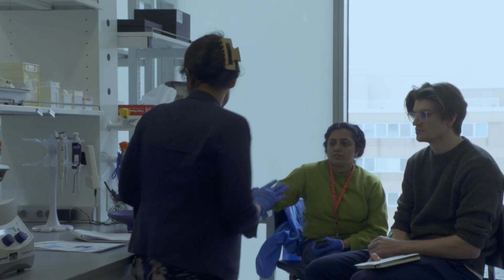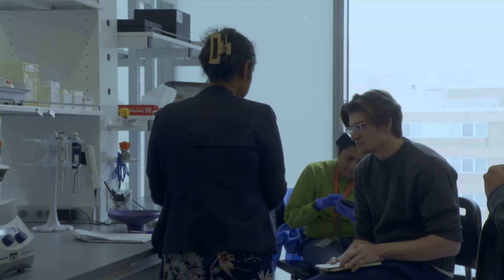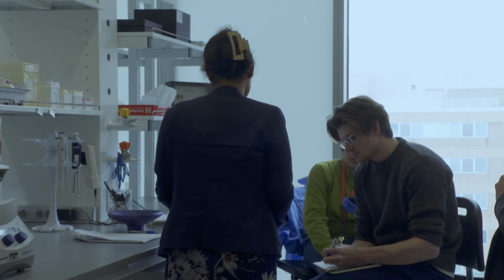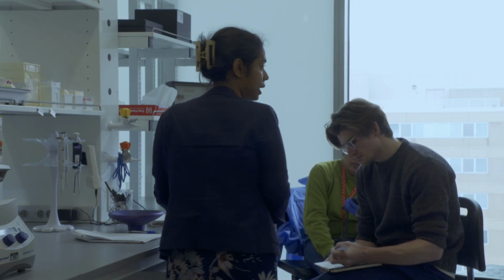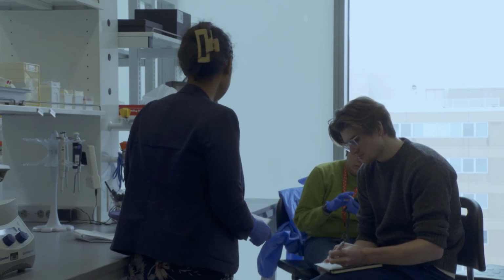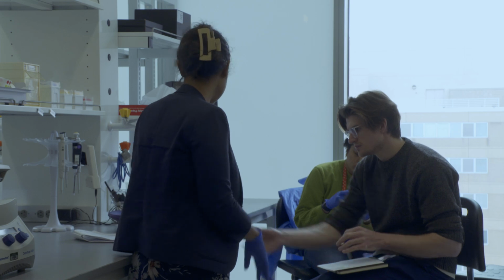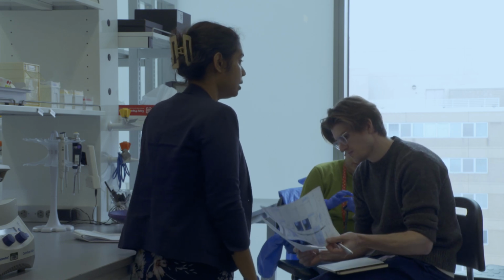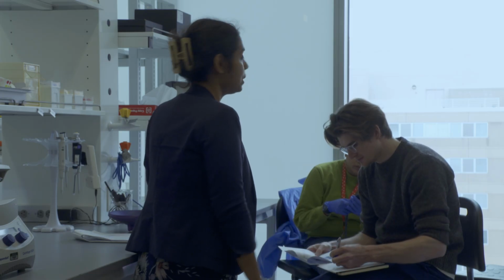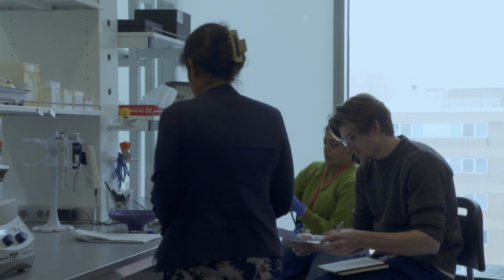So let's do one thing. However you want to pool it, calculate. There are 6 samples. For each reaction, which is the end repair, we need 20 microliter of sample. But I think you need to do dilution of a few samples. So you can just do that calculation. Then we can make the master mix and we can start the end repair reaction.